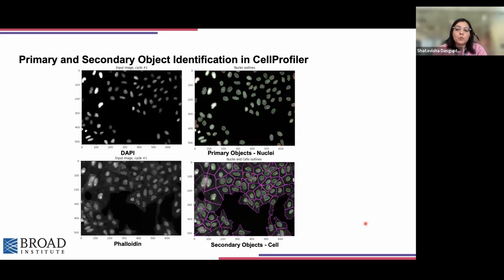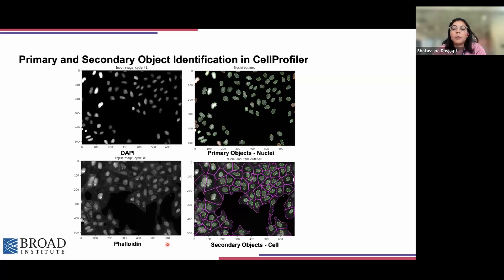These are the principles which CellProfiler uses. The output window from CellProfiler will look like this when we perform primary object identification using the DAPI channel, which stains the nuclei — outlined in green. If we have a membrane marker or markers for other organelles, we can use that channel to identify the secondary object, using the primary objects as a seed. By subtracting the nuclei from the secondary object, we are left with the tertiary object, which would be the cell cytoplasm. Identifying all these individual compartments allows us to perform many different kinds of measurements.